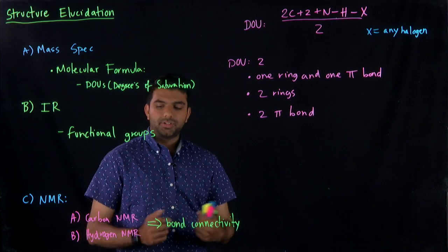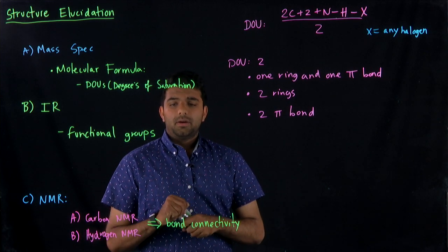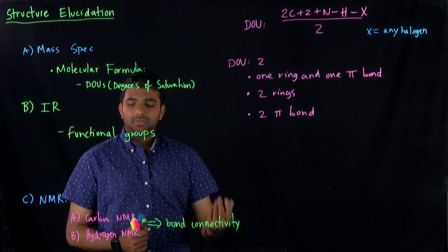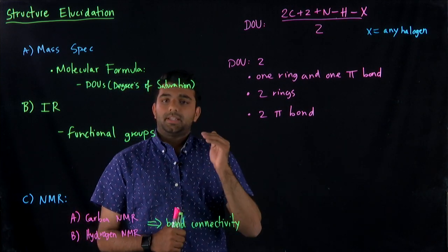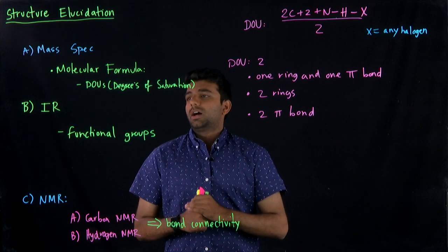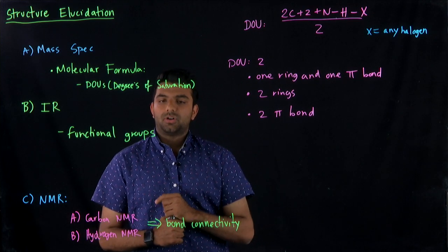There are going to be other videos that help explain NMR. It is a very broad subject, and there's a lot to it. So if you're confused on NMR, there is going to be another video on that. But this video is just to show you how to approach structure elucidation by taking each piece of analytical tool and data obtained to draw a final structure.